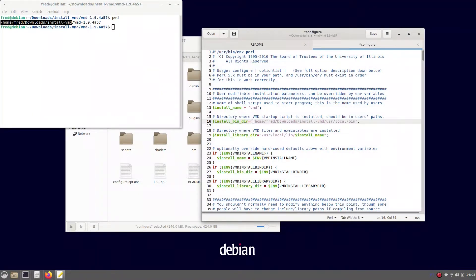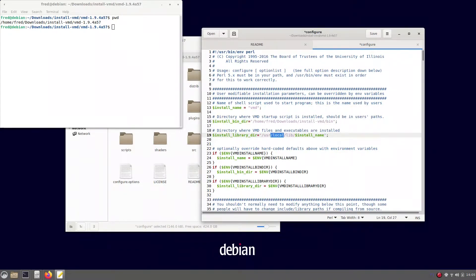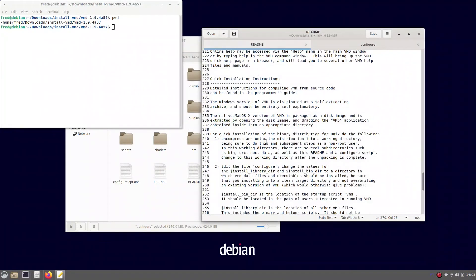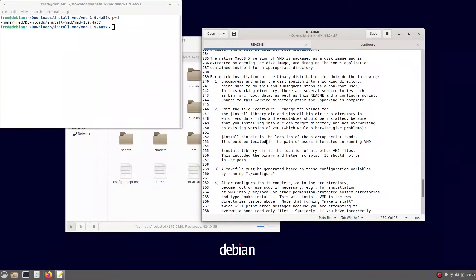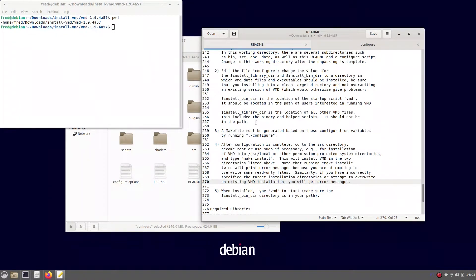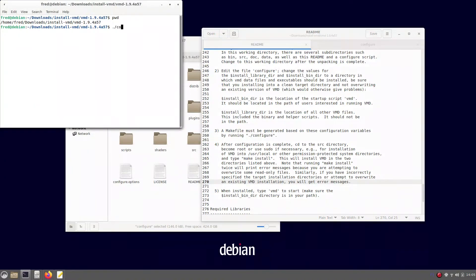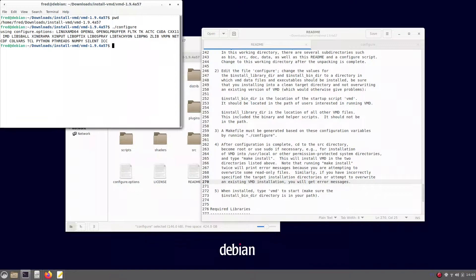In our case, we are going to use the folder we have created as a base, and then change the parameters in the CONFIGURE file to comply with our needs. Just be sure that you are not messing up with the script — don't delete the quotes or anything like that — and give the entire directory path. After that, you have to type dot slash configure and hit enter, as we have done. Before that, don't forget to save the CONFIGURE file.